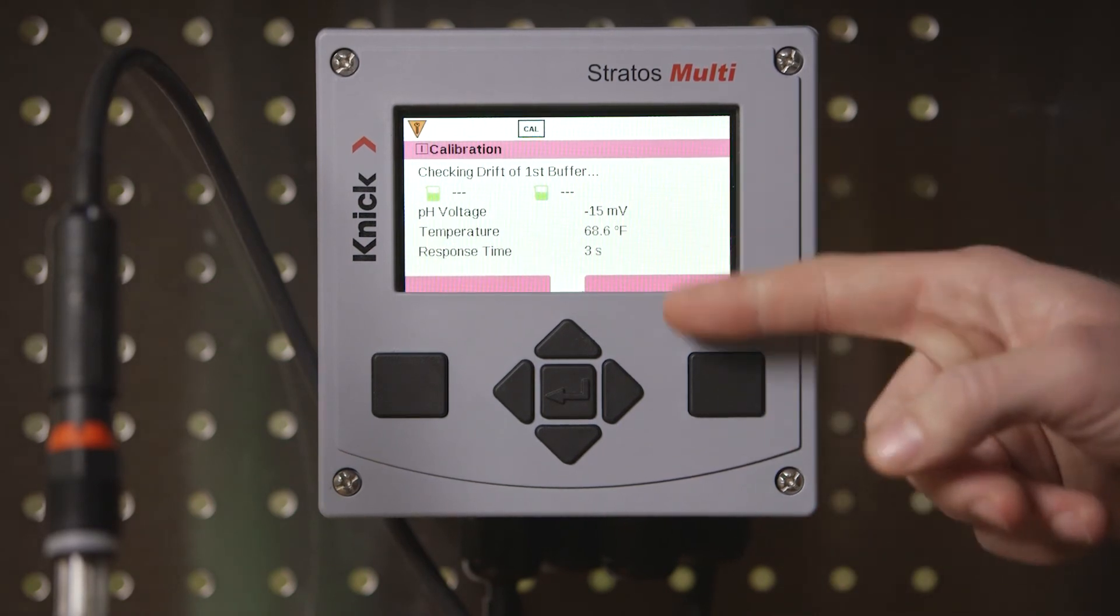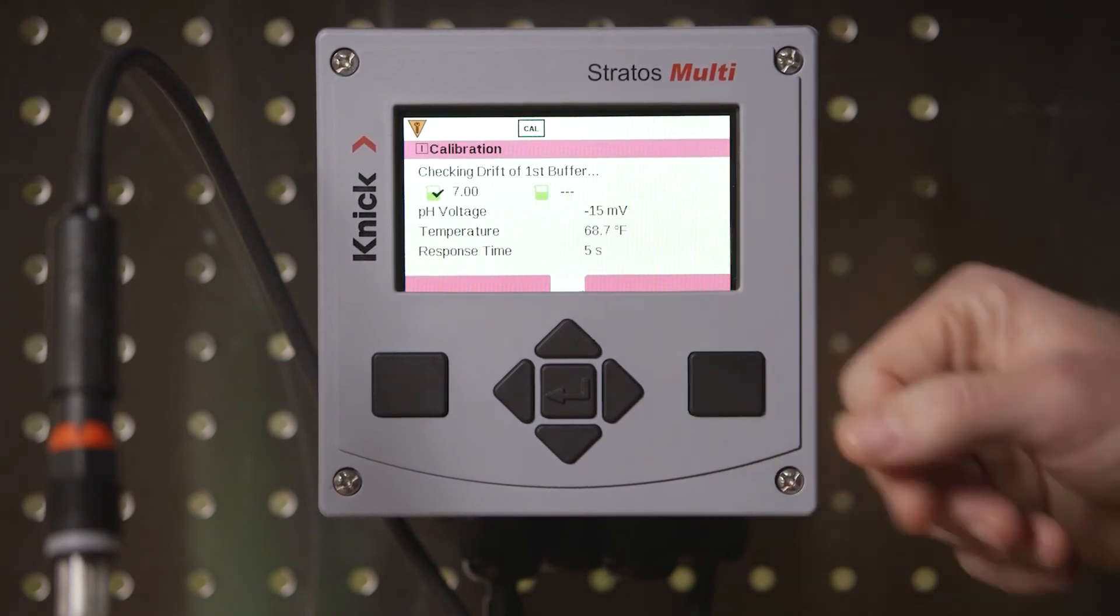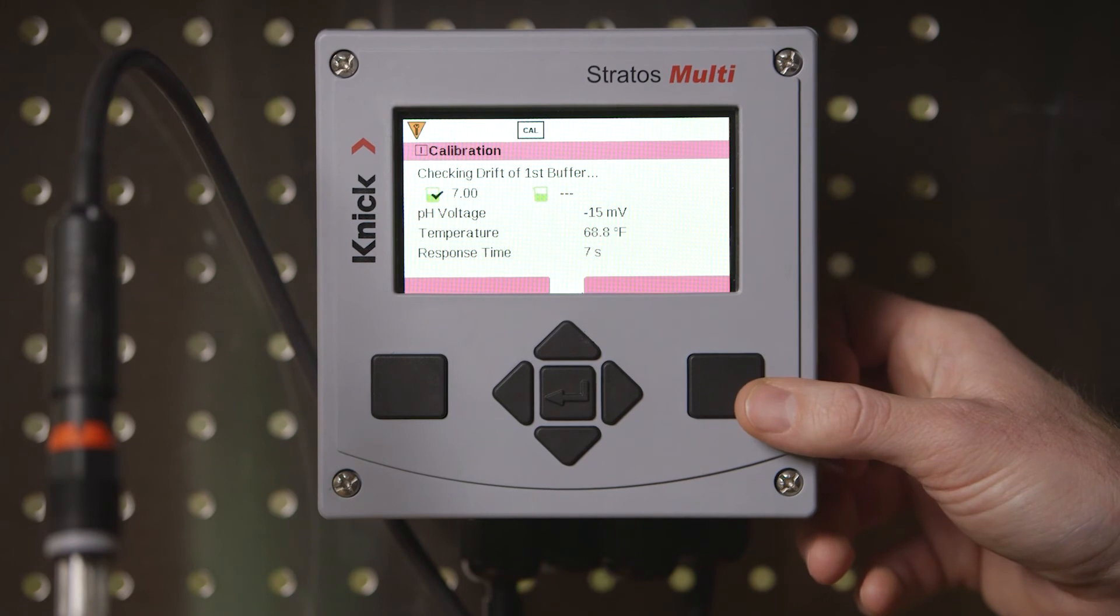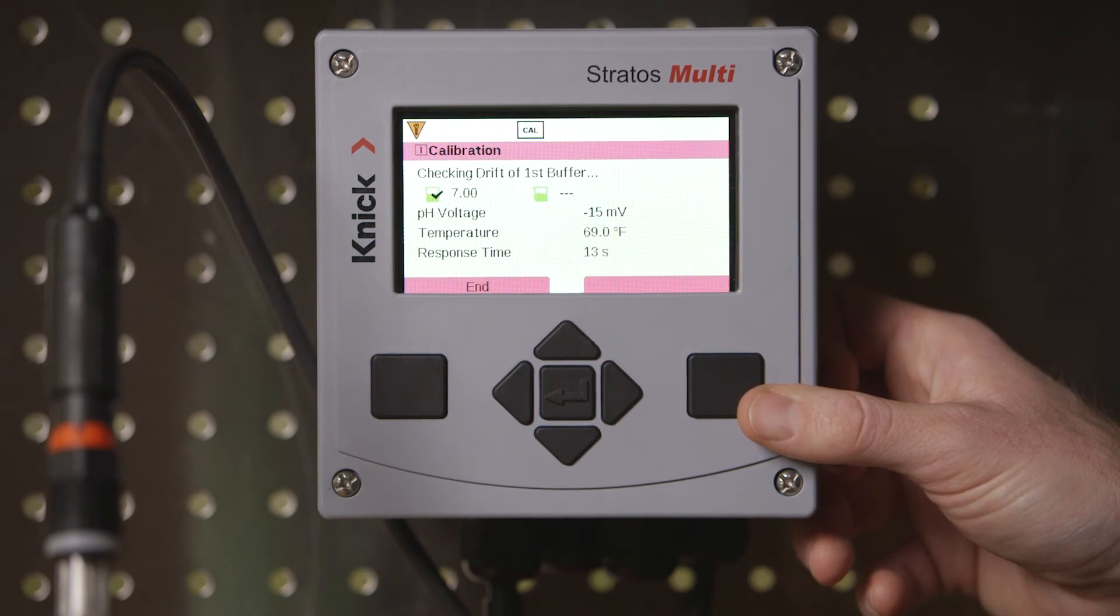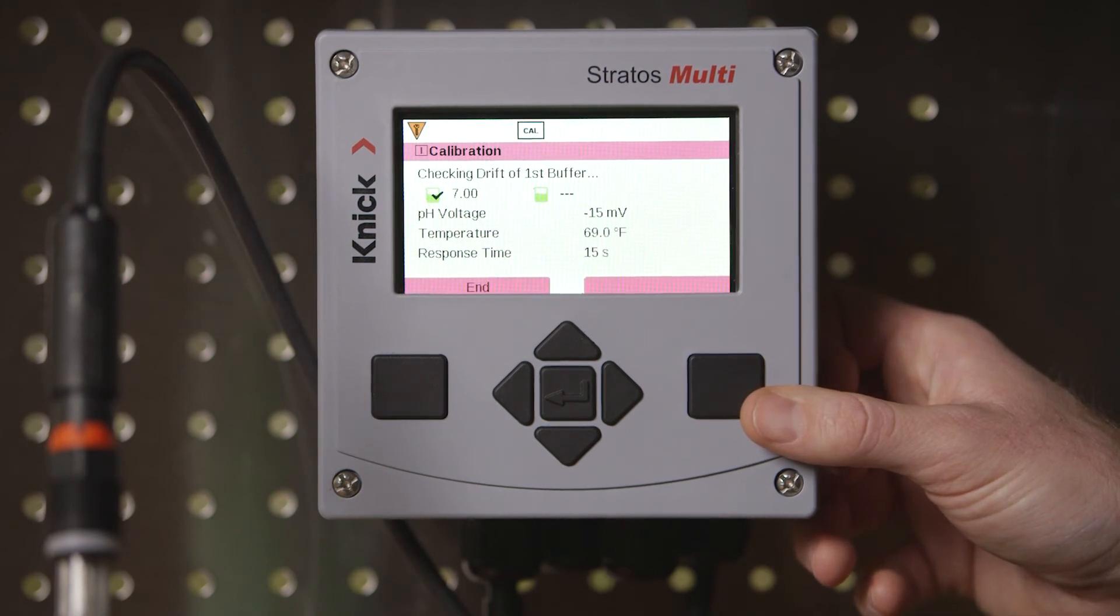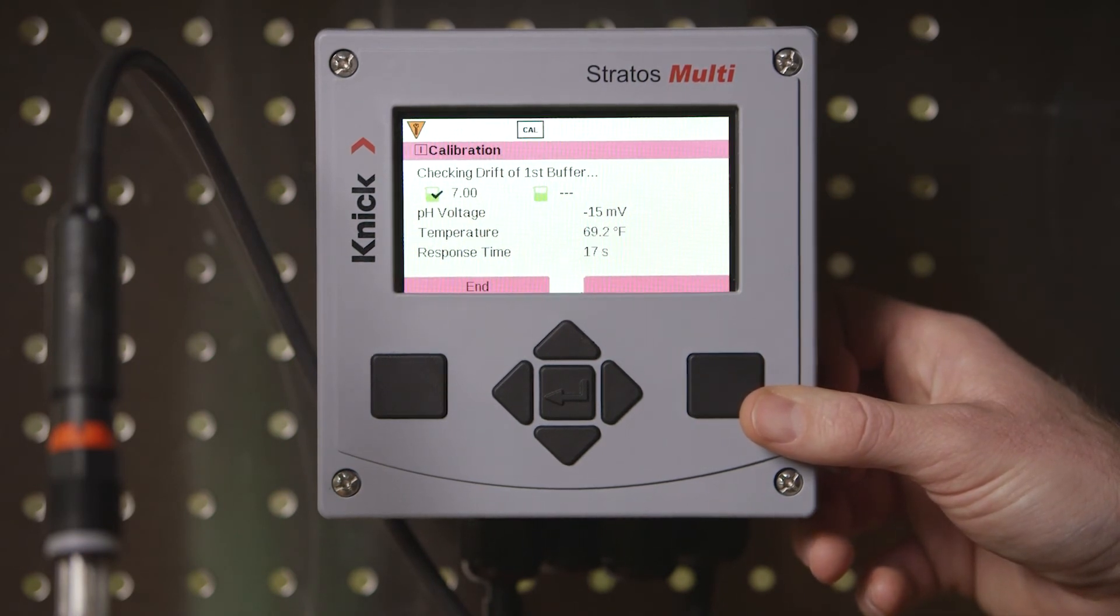After pressing next the transmitter will begin to check the drift in the first buffer solution. You can see that the buffer value is automatically recognized. The raw pH voltage value is displayed along with the measured temperature and response time of the electrode in the buffer.